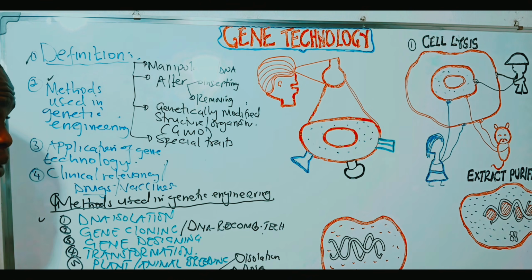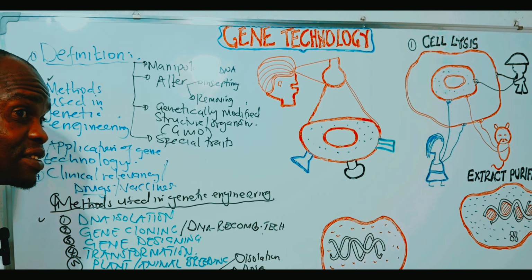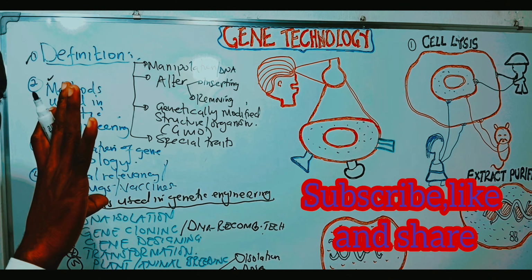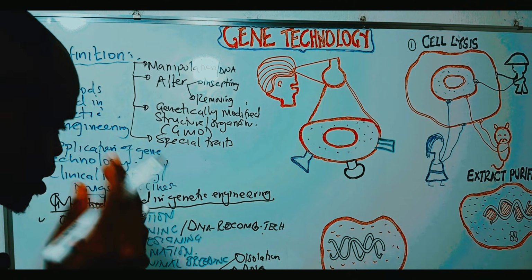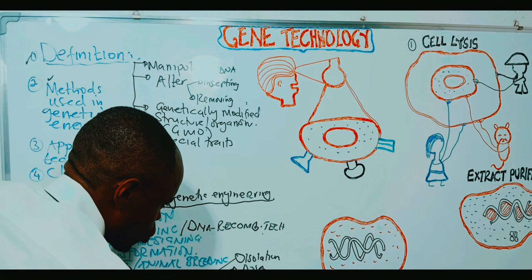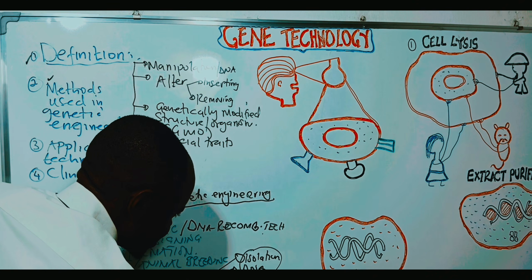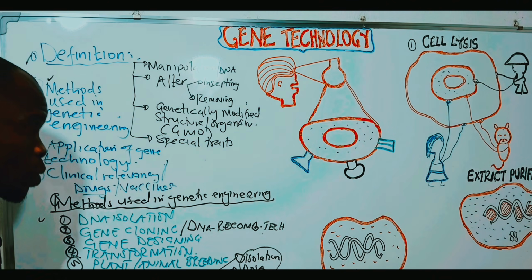We do this using several mechanisms. How do we separate it? By breaking, rupturing the cell membrane. The cell membranes must be broken down. You get the point, members? That means we are isolating using certain procedures, and we're going to look at them.